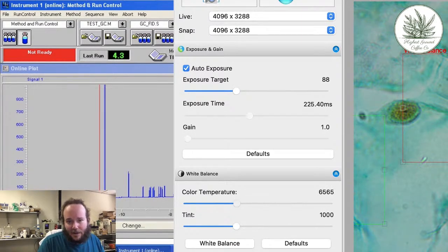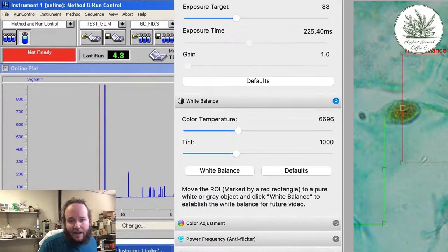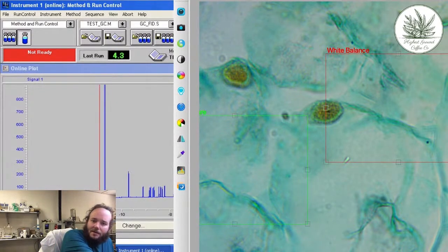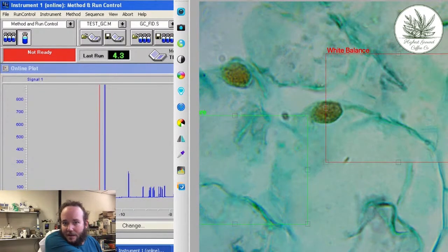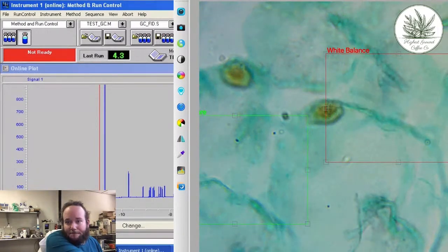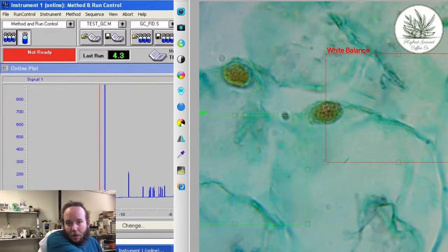Yeah, scopes are really cool. I'll be honest, I don't really get to use it as much as I might want to normally. And part of that is, I mean, you see me screwing around with this. Sometimes it can take a lot of time just to get the right image. So it's not always prudent. Now, obviously, you won't get this kind of resolution from your phone, but they do sell.